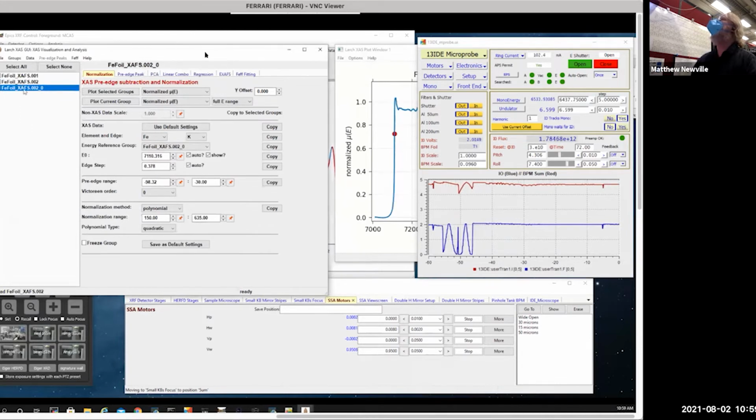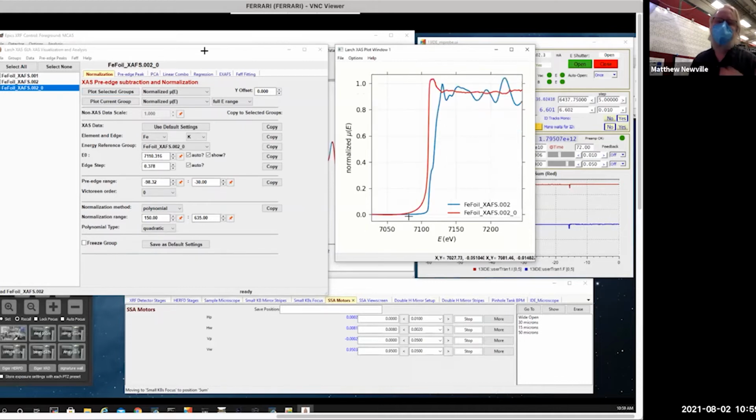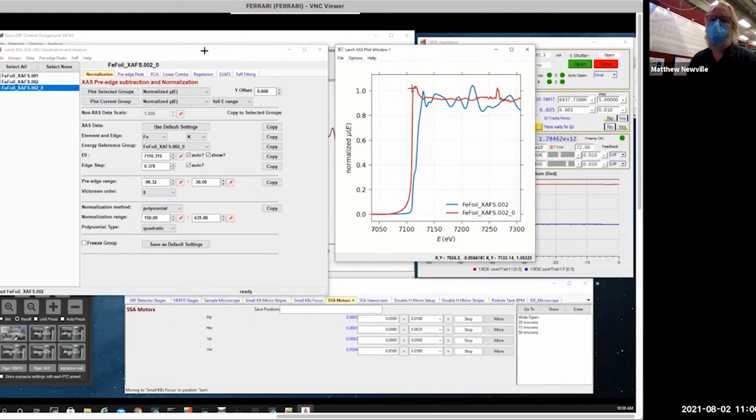Those two together, it's totally wrong to measure that in fluorescence. That's the fluorescence data. You can see that it peaks up much earlier, and it's completely saturated, so the XAFS are just totally gone as I go over the edge. It's totally useless. So on a sample that's this pure, you can't collect it in fluorescence. Really, if it's more than 5% weight, it's dicey to collect it in fluorescence at all.